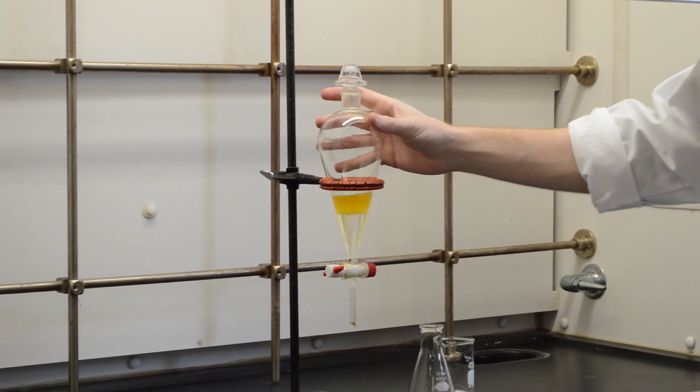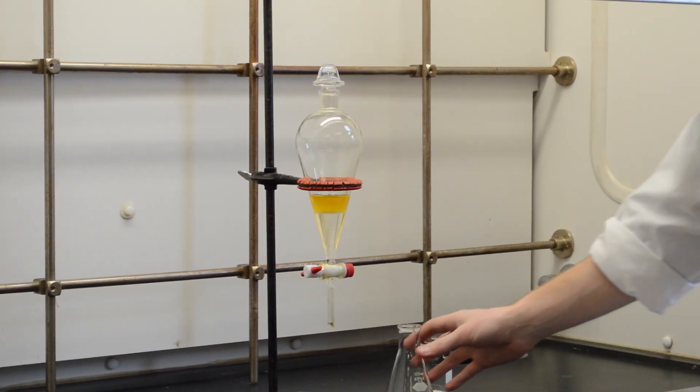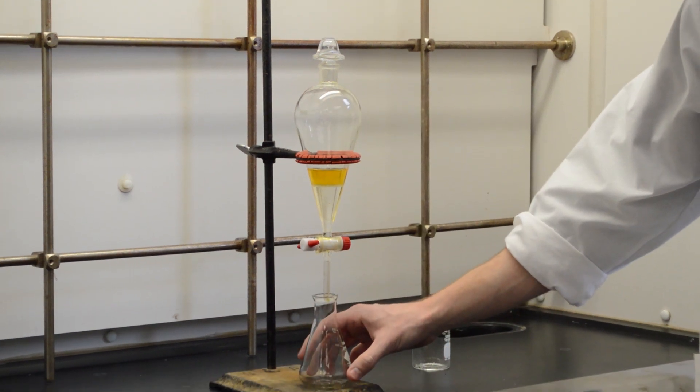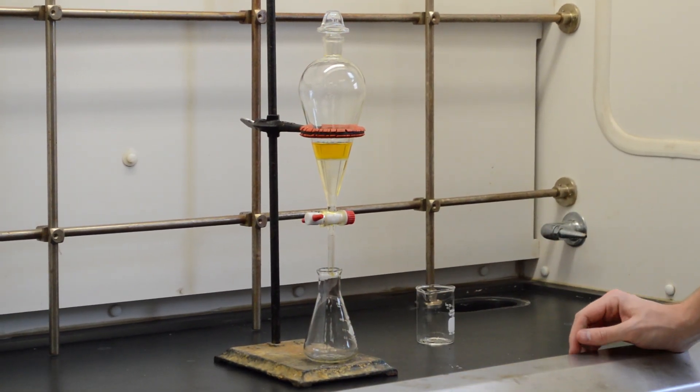When you let it rest for a little while, you can see the two layers form. In this case we've used dichloromethane and water. Dichloromethane is actually heavier than water, so it will be the bottom layer, but with a lot of different organic solvents you'll see that layer on the top instead.